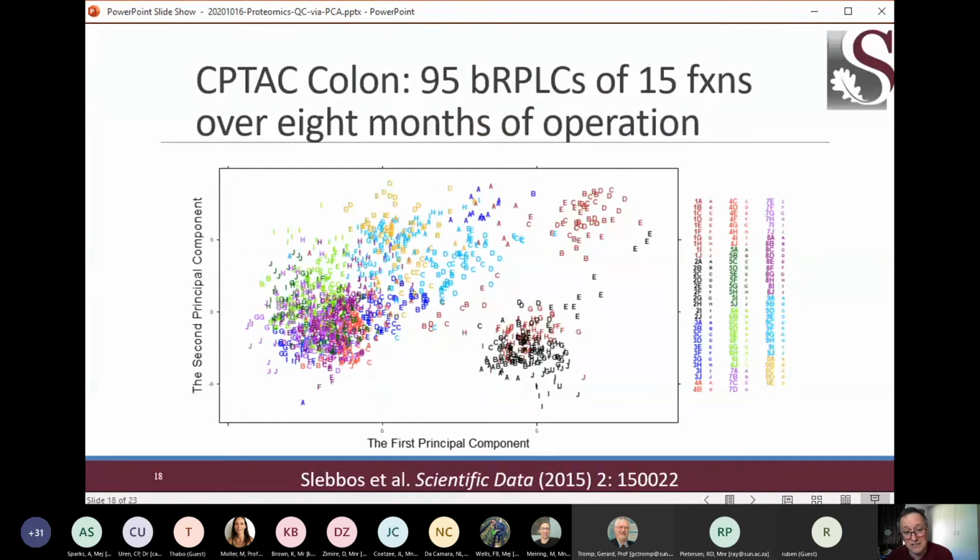All right, now this is one of the largest proteome data sets that I've had the fun of working with personally. This was part of the CPTAC at National Cancer Institute colon cancer project. So we were evaluating 95 different samples, and each of those samples was not represented by just a quick 1-hour experiment on the instrument. Instead, we were using fractionation up front by something called basic reverse phase liquid chromatography. So each sample was represented by 15 raw files, not just one. As you can see, over 95 experiments and 15 fractions, you have a very, very large number of files. In total, I believe the count was above 1,400 that we encountered for just this aspect of the data set, and there were others as well.